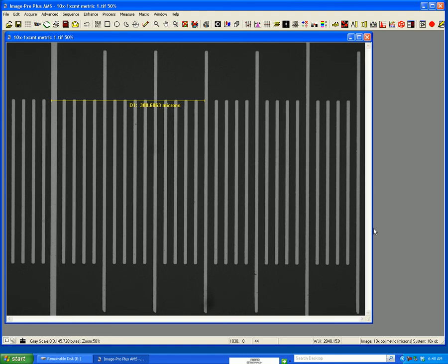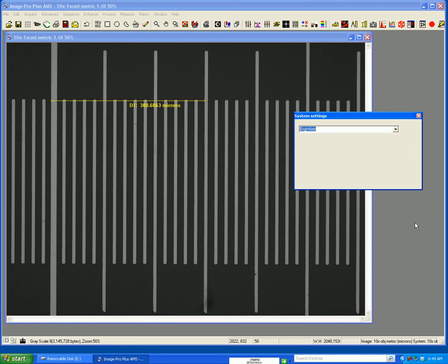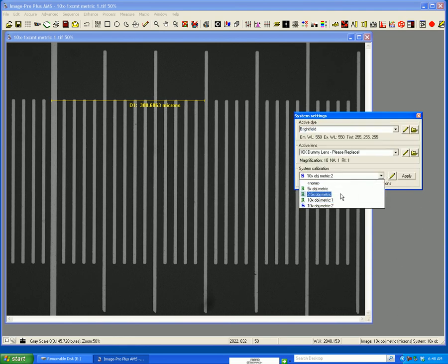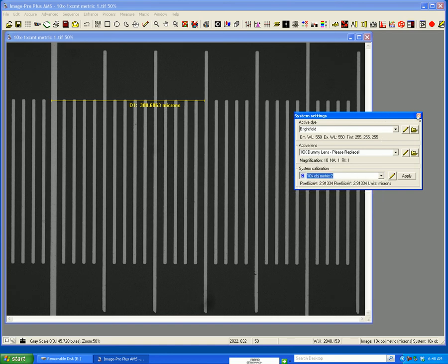Another note, if you look in the lower right-hand corner, you see this measurement box. If you double left-click on it, you'll have a pull-down menu with all the objective calibrations that you've saved and you can apply it to the image.